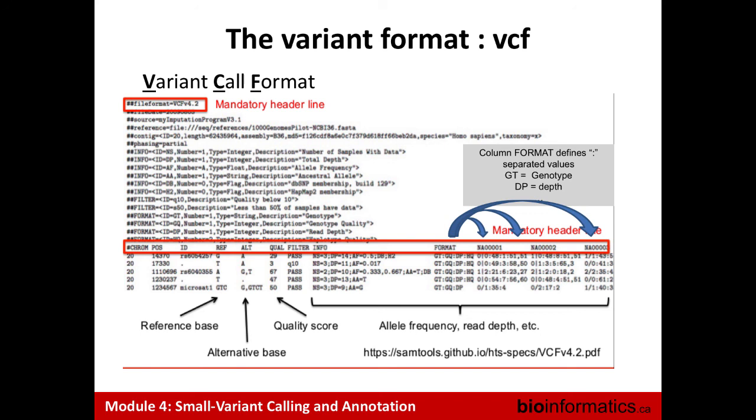So when you look at one variant, you've got the real information on all the other samples in your analysis. And you say, okay, if I don't see a variant there, it is either because I don't have reads to cover this region, or I don't have evidence of the variant. It's largely to deal with batch effects.